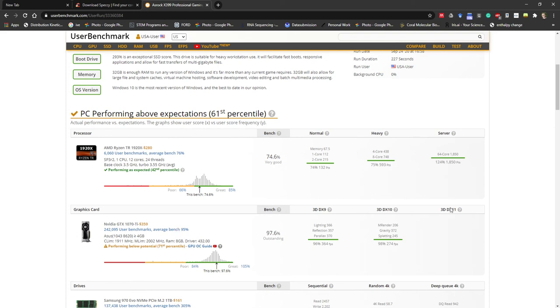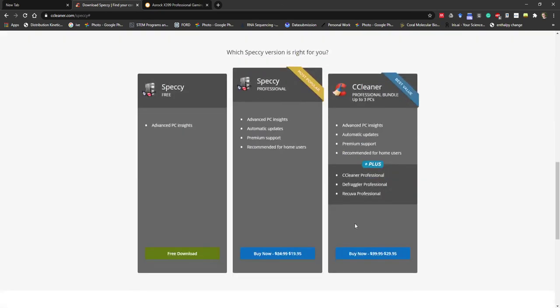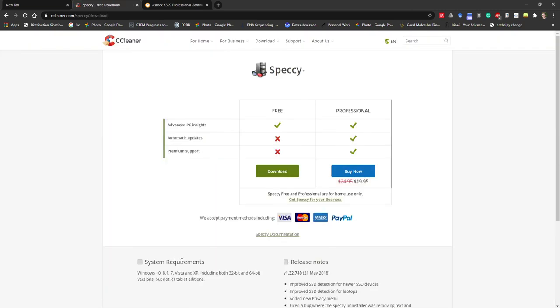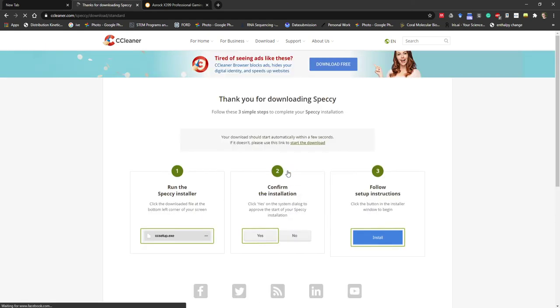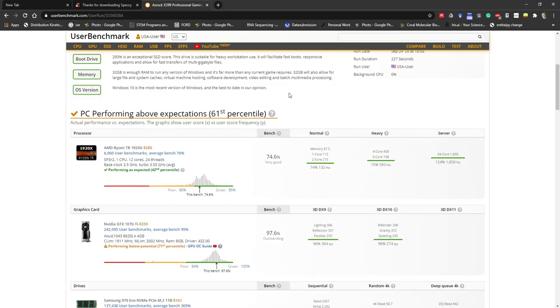Preferably, if you have a lot of samples, like say over 100 samples, have at least 4 cores and about 3 gigahertz. 32 gigabytes is fine. 16 gigabytes is fine too, a little bit slow. But higher than 16 would be good. And for people that have, let's say, 10 samples or 20 samples, it might just work out. Like your MacBook Air, for instance, might work well still.